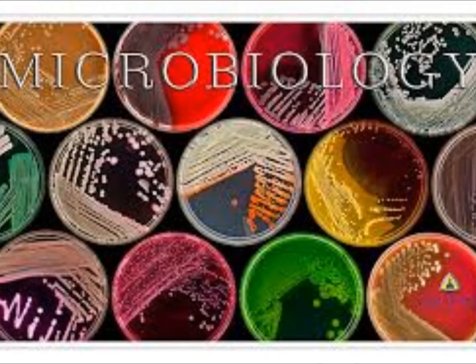And it's really hard to see on here, but I'm going to pass some plates out in a second when I get done talking about all three, and you may be able to see it better on the actual plate. But you'll see a colony and it will have a green halo around it if it produces alpha hemolysis. Our next type of hemolysis is the beta hemolysis.